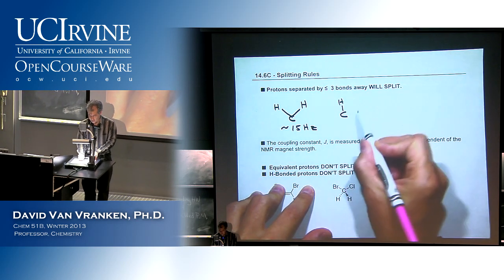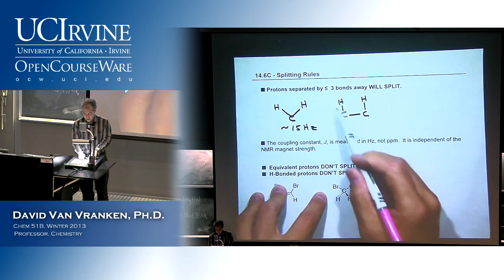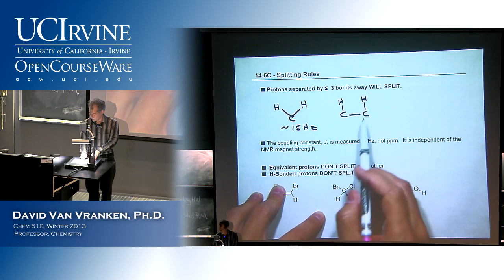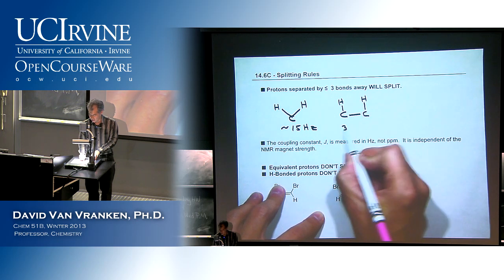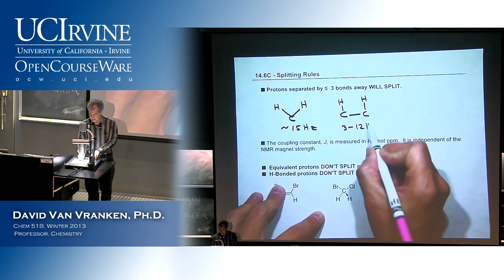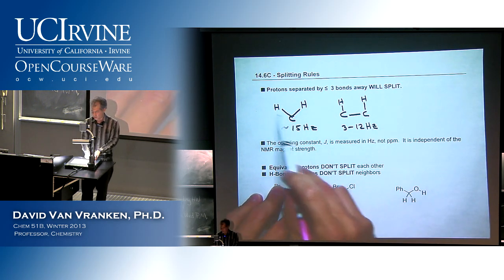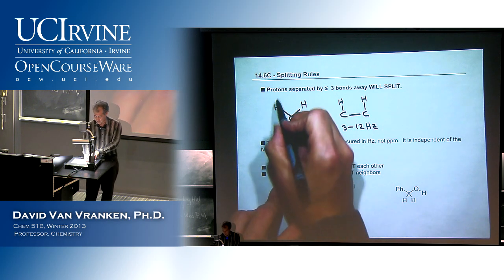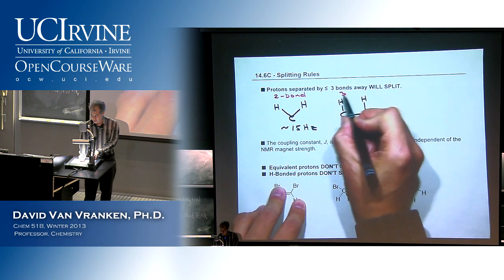The second coupling scenario is where they're on neighboring carbons. We would call that vicinal coupling. And if I count how many bonds between these two protons, there's 1, 2, 3 bonds. So that's a 3-bond coupling. And this varies hugely depending on the torsion angle. So 3 to 12 Hertz, right? So in other words, at best, it's almost as big as a geminal coupling, a 2-bond coupling. But at worst, it's almost zero. So it can be very small and hard to see that coupling. So I typically would call this a 2-bond coupling or a geminal coupling. And I would typically call this a 3-bond coupling.